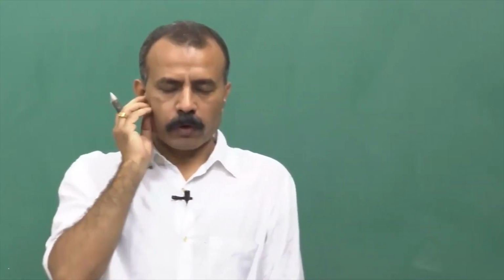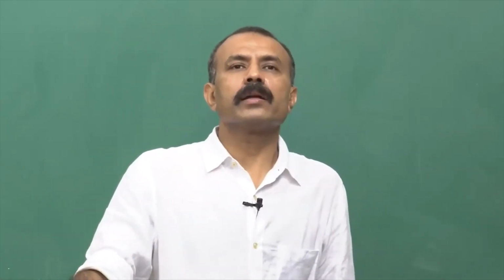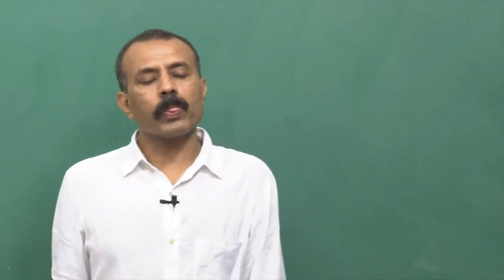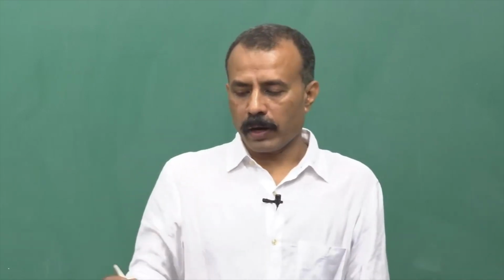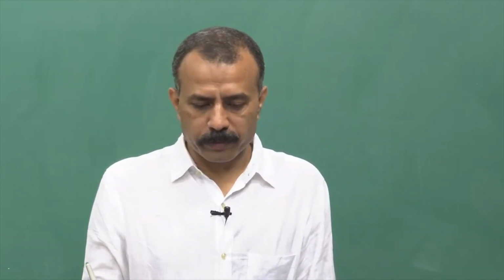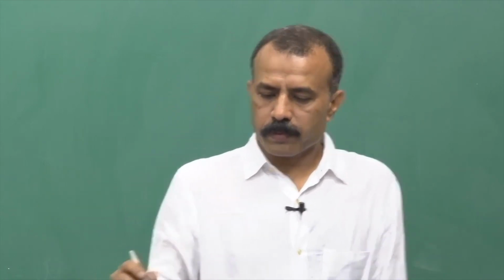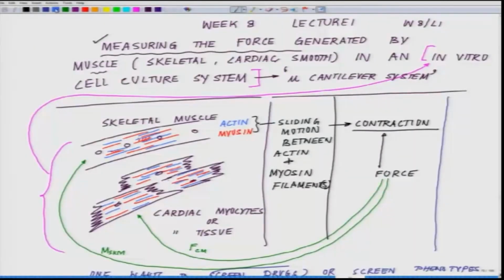electromechanical systems. So, here you only see the mechanical part of it, and I will introduce the electrical part of it soon. So, now based on it, let us go back. What is our problem statement? Our problem statement was, or is, measuring, going by the words, the force generated by muscle, whether it is skeletal, cardiac, or smooth, in an in vitro cell culture system, which is a micro cantilever system.